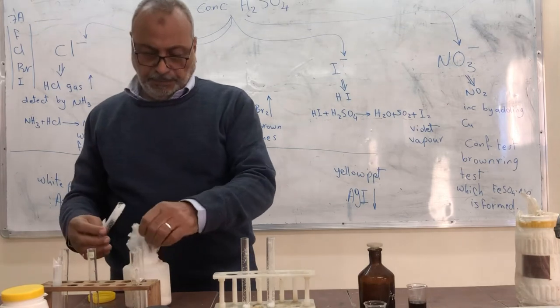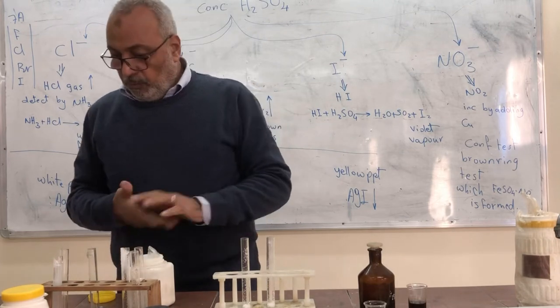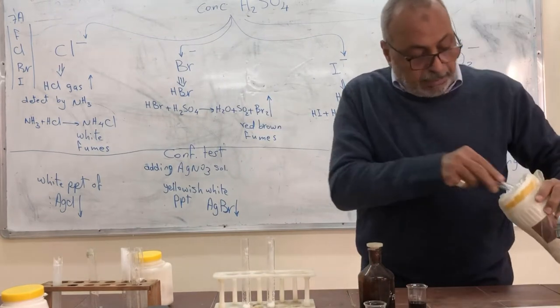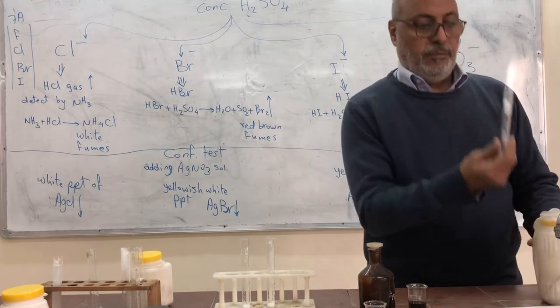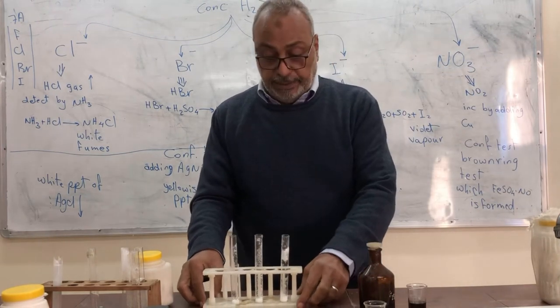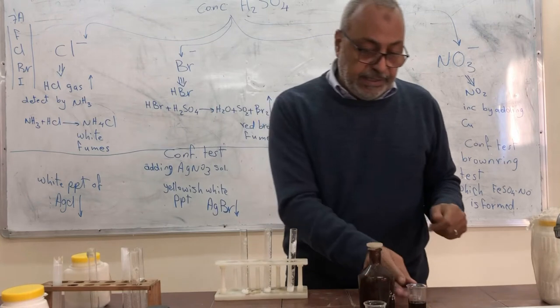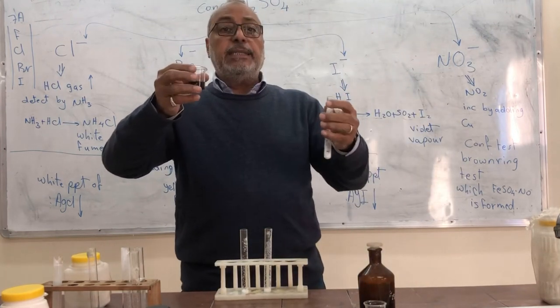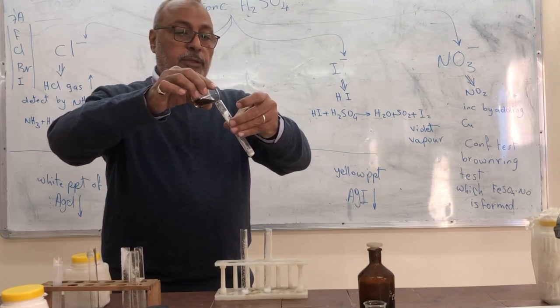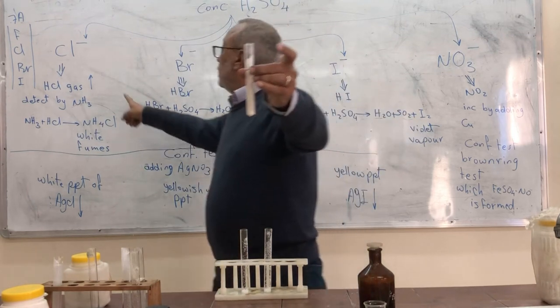Take a small amount of sodium chloride, and the main agent is H2SO4. We must use it concentrated for the results and record our observation. Firstly, we will add conc hot sulfuric acid to the chloride salt, sodium chloride. It produces a gas. This gas is HCl.